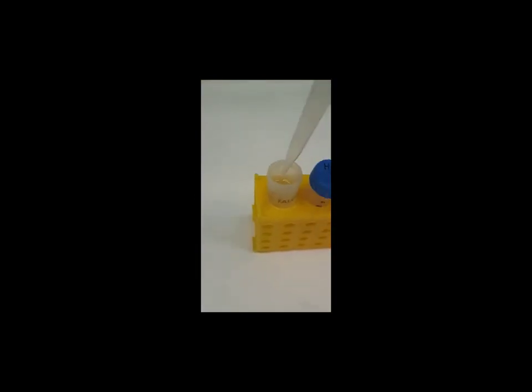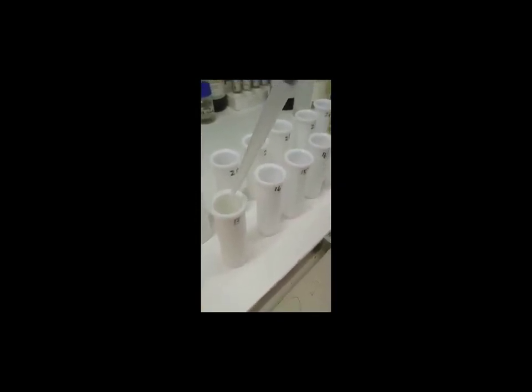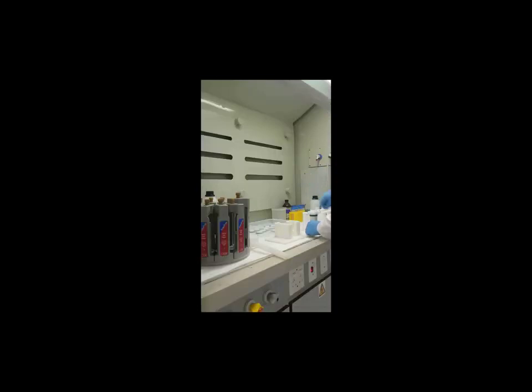6 milliliters of ultra-pure nitric acid and 1 milliliter of hydrogen peroxide are then added to each vessel. Samples are digested in a 12-place carousel where a blank and certified reference material are digested along with the samples. Samples are closed with a Teflon cap and left to pre-digest for 30 minutes. Each vessel is inserted into an individual heat protective sleeve before placing it into the carousel.